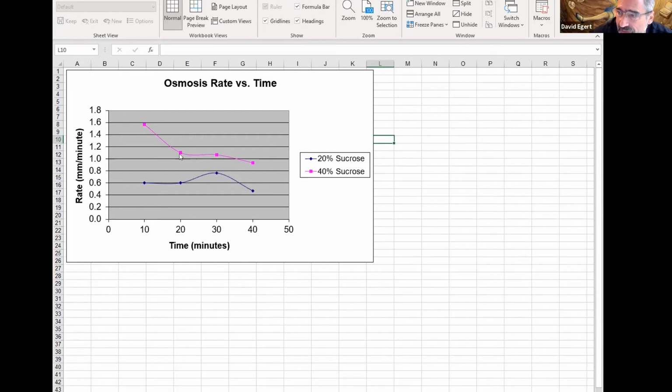Right. So all of these data points are kind of loosey-goosey, but I would say that this is starting to become more asymptotic, which is kind of what you'd expect. It's starting kind of fast, but then becoming less and less. I don't know, though. I would not get too fancy in the theorizing, given how messy the data is, or ascribe much meaning to anomalies that you see. That's what I would say.